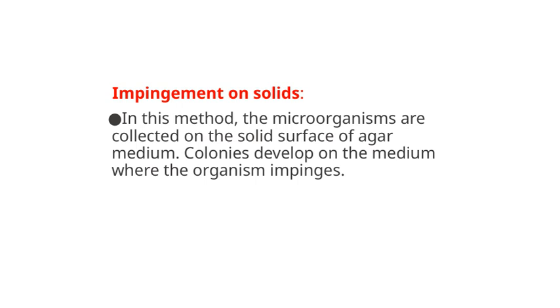It's a straightforward way to assess microbial presence and activity on solid surfaces, which is a key part of understanding microbial contamination and behavior. So, in summary, this technique captures microorganisms on agar where they land, leading to colony formation that we can then analyze further.